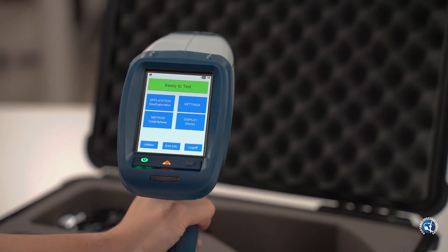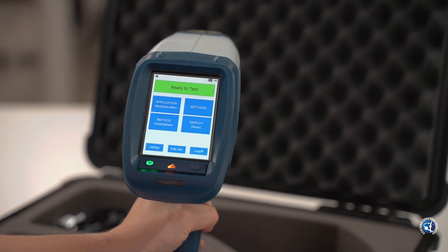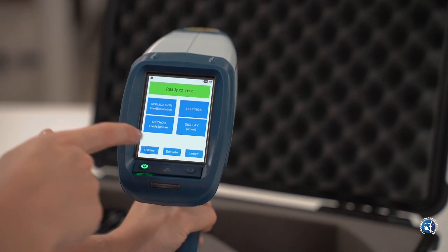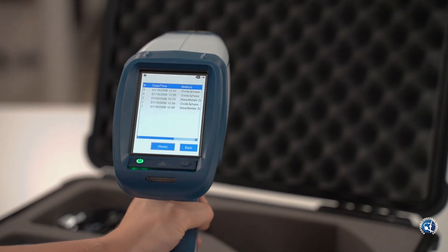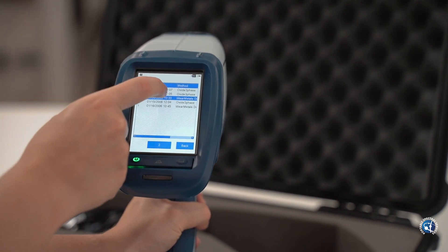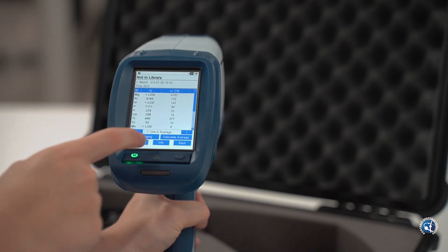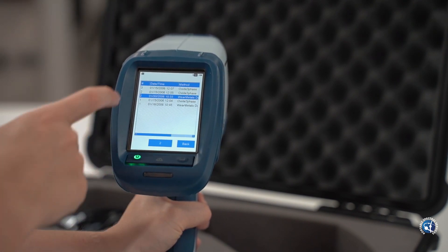To review results from the home screen, press utilities, results. Double click on an individual result to view. Use the arrows to toggle back and forth between results and if you want to exit, click back.